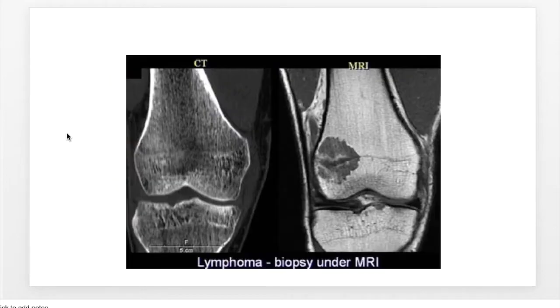The LCPC transform is also applicable to really any image or other biological systems, such as here CT scans and MRI scans. The only thing that the investigator has to figure out is where to place the point of origin and what features they want to quantify. Is it just the edge? Is it the degree of pores, and so on and so forth?